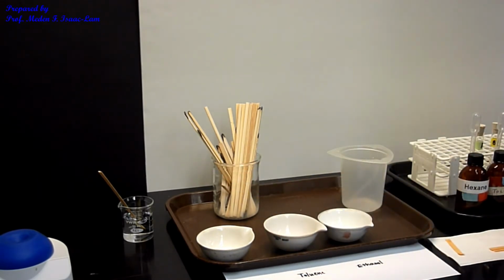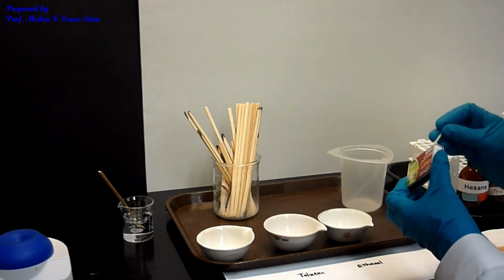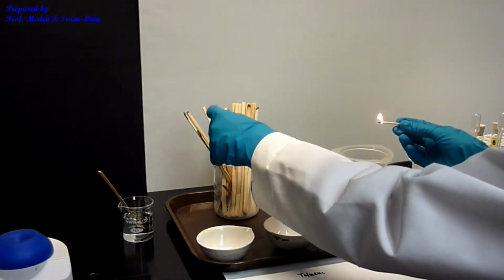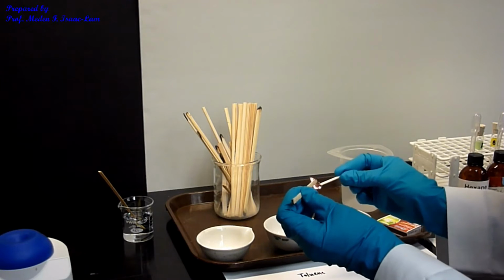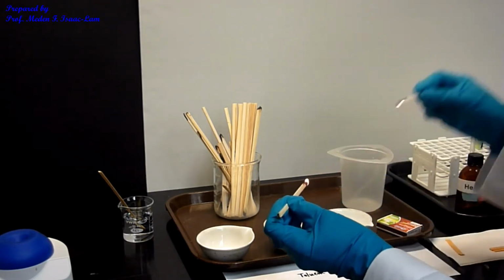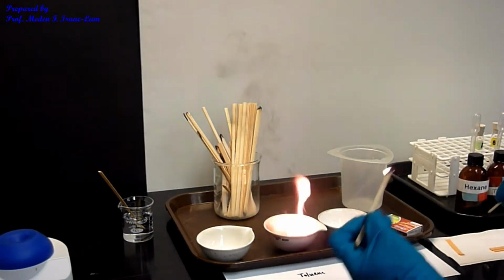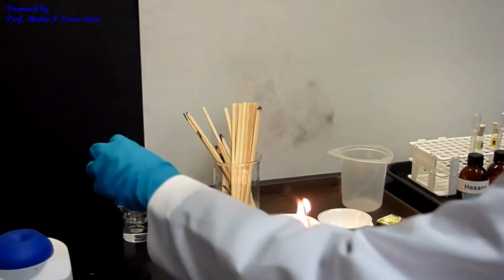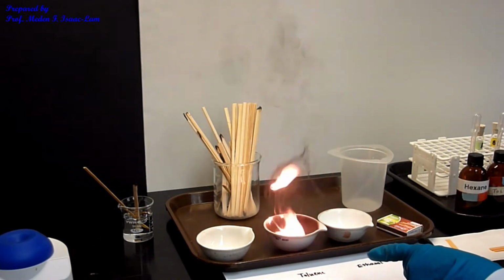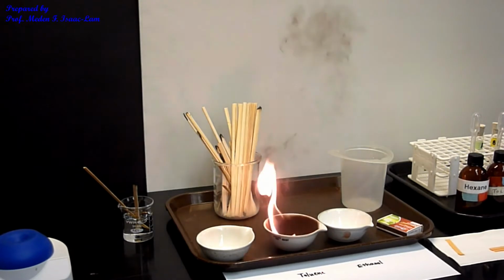So now I'm gonna do actually the same idea. And I'm gonna use this part here. Okay, so you see it's flammable, but see the difference is you have a lot of soot.